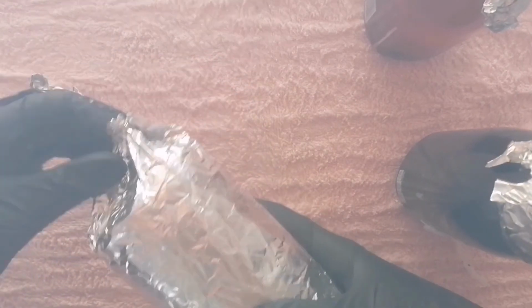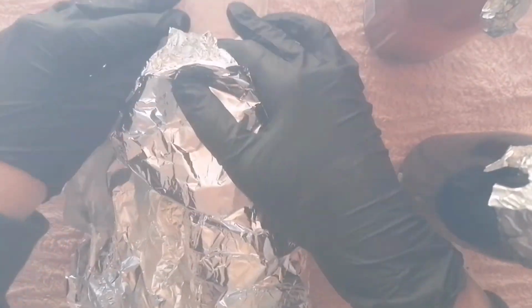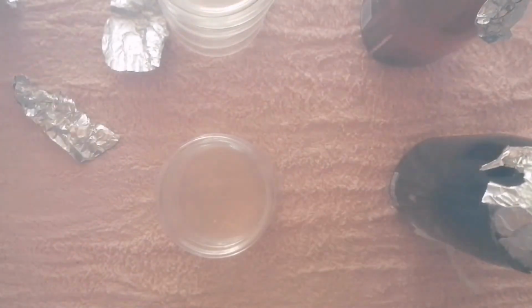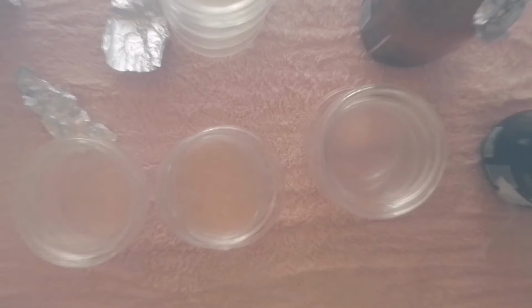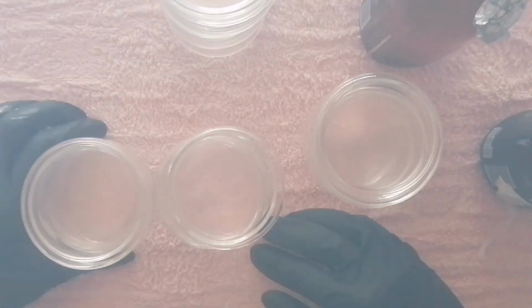Okay, so here we go. These things have cooled down considerably. So I'm just opening up the petri dishes. Be careful, they are hot and you would like them to stay in their form. So I'm just packing them into my little stacks. I realize that 5 stacks are enough. Okay, so here I'm just opening the second one. So there we go. Now I'm going to pour the agar.